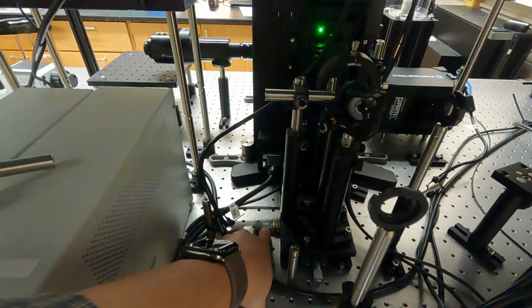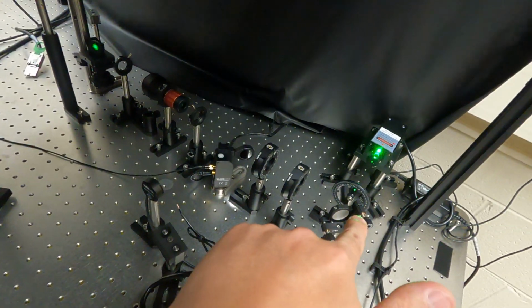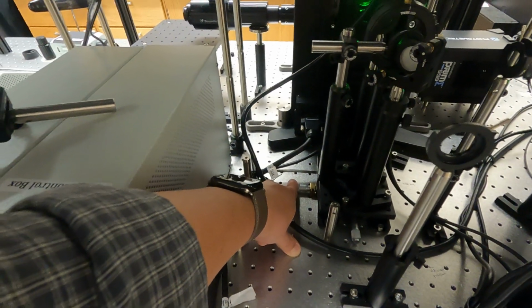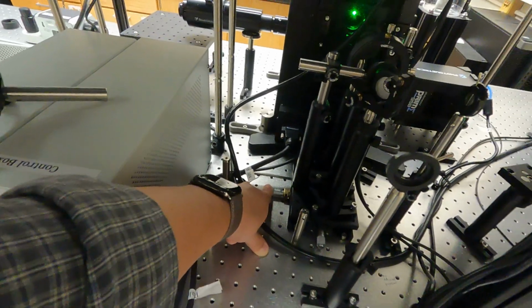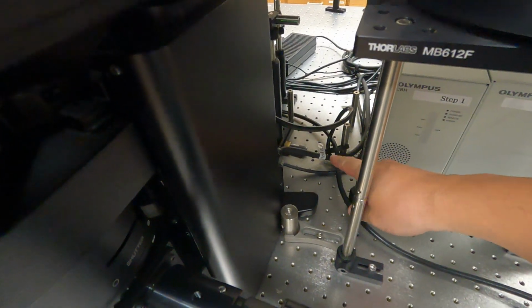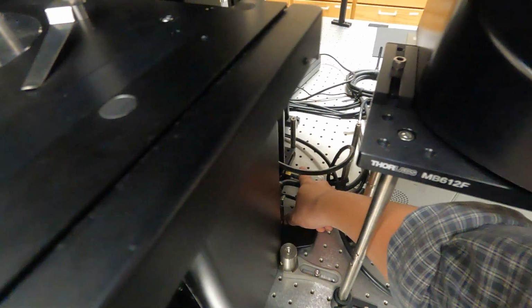Essentially, for the laser part, we'll just consider the power using the dial, the flipping mirror to measure the power, and lastly this knob on this translation stage to control the angle of the incident beam into the microscope body. Of course, when you are doing the experiment, you will be reaching this knob from the front of the microscope. It is a little bit hard to reach, but it's still doable. You will have to move your hand over to this position and carefully adjust this knob from here.